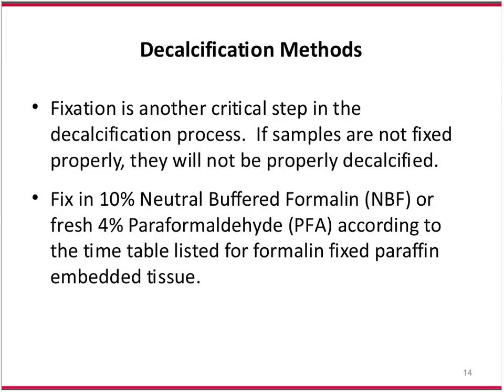So as I said, fixation is a critical step in the decalcification process. If samples aren't fixed well, they also won't decalcify well. We fix all of our samples in 10% neutral-buffered formalin. Sometimes, very minimally, we use fresh 4% paraformaldehyde according to a timetable that will be posted.